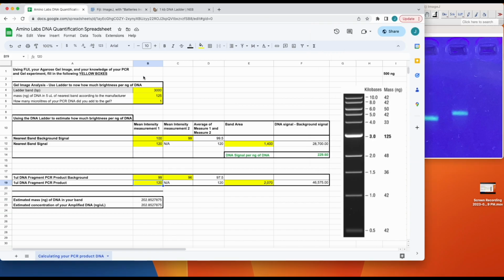Okay, so let's go over to the spreadsheet here. There's a few different areas. One thing to keep in mind is you only need to modify the cells that are yellow in color. The rest are areas that will just auto-calculate. And let's get going here.